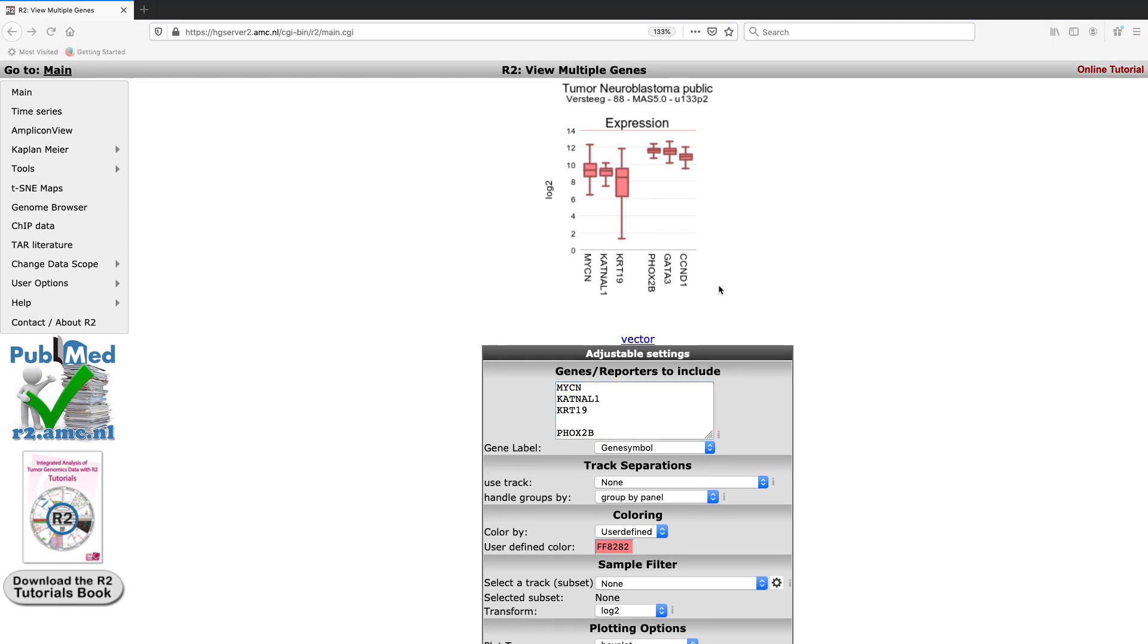As you can see below the plot, there are a number of adjustable settings which you can use to alter the appearance of the plot. For instance, you can split these panels of genes up based on tracks or sample annotations that are available for this dataset.